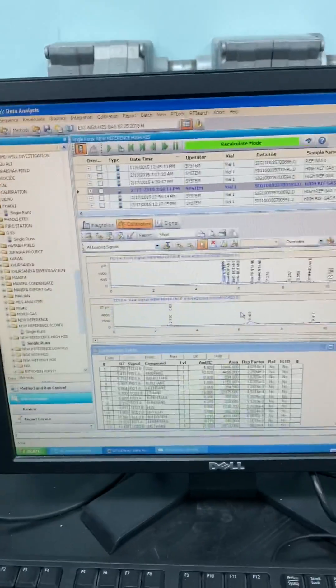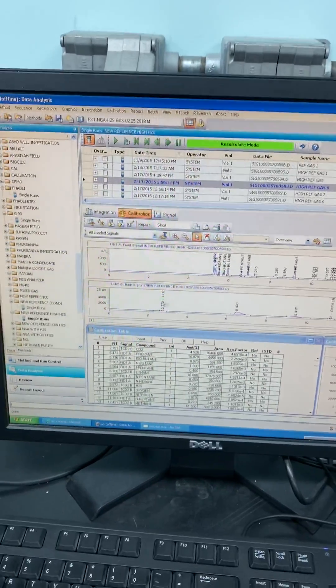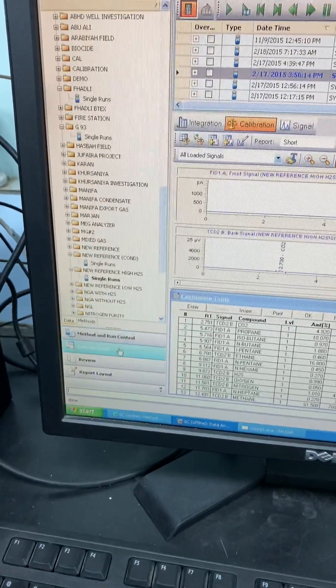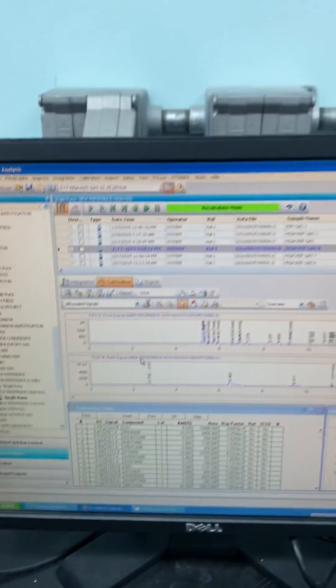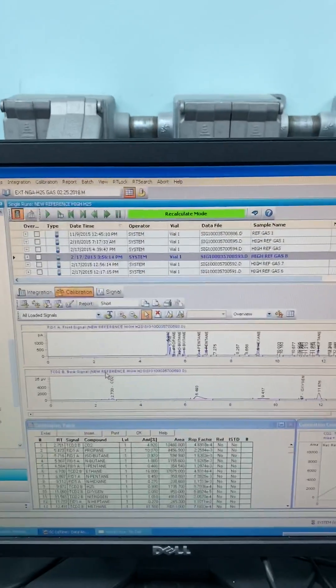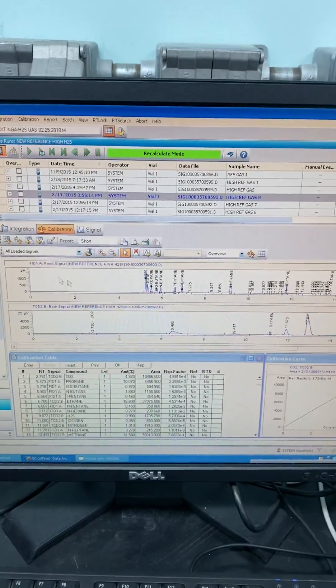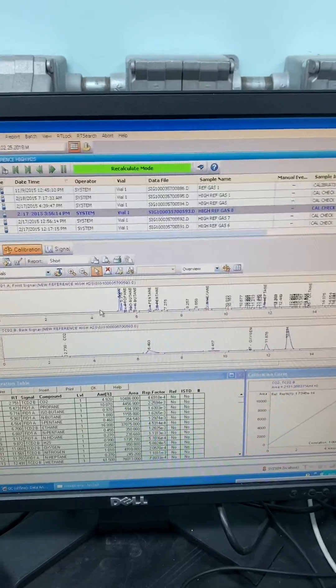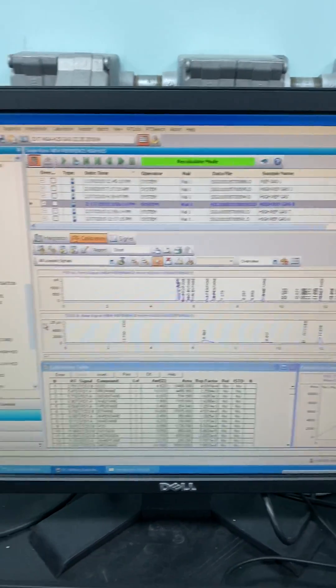How to do the result analysis, comparing peaks, calibration, and everything, inshallah. This is the ChemStation software. I am already in the data analysis section. In data analysis, you will see all the peaks of each chromatogram that you have.